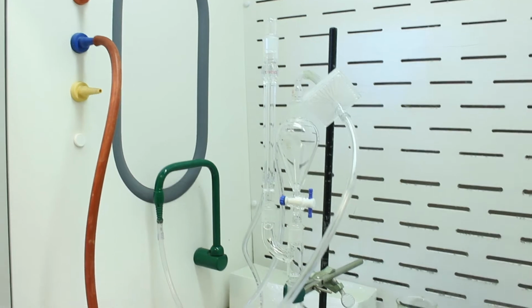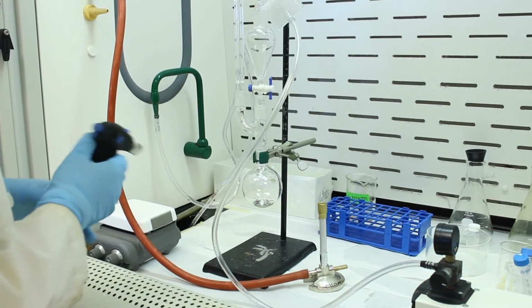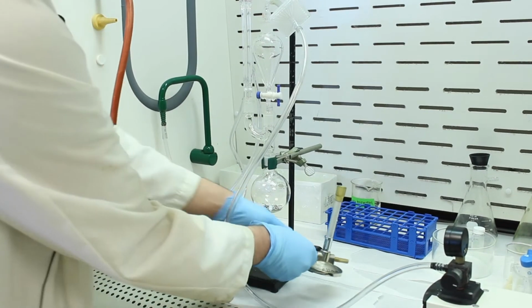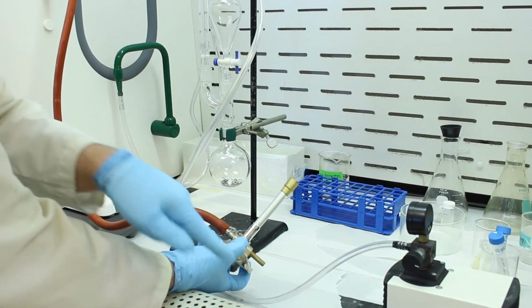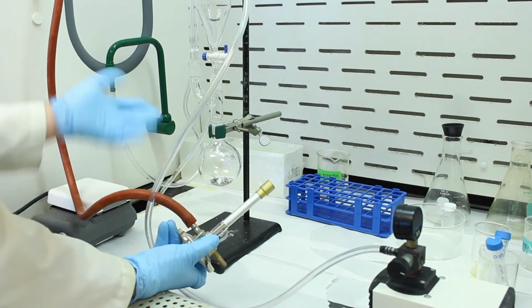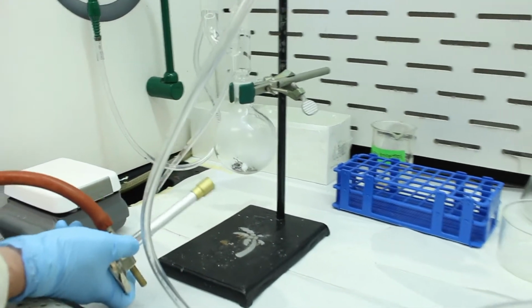Okay, so let's start the gas. We'll just make sure to keep this tube out of the way. Okay, so the Bunsen burner is lit. We'll adjust it so we have a blue flame, so you can sort of see the flame here. I'm going to turn on the vacuum and then heat the apparatus, and you'll be able to see some of the water vapor vaporize and be sucked out of the apparatus. You'll also see some water vapor on the outside of the glass.